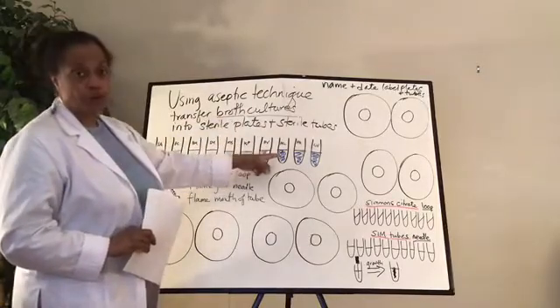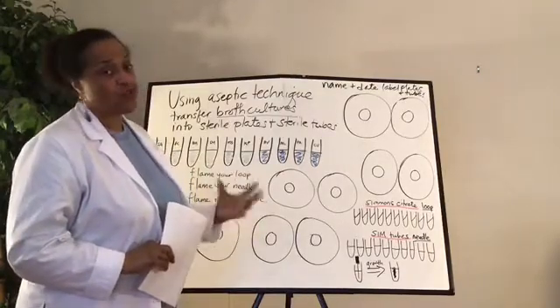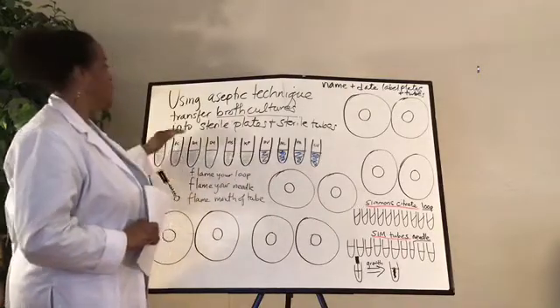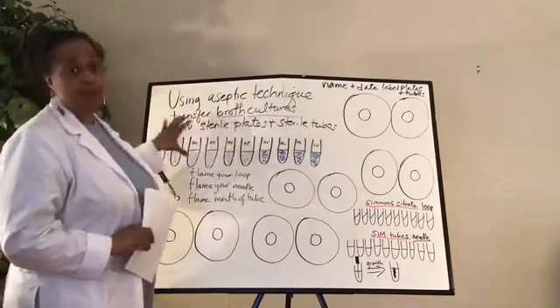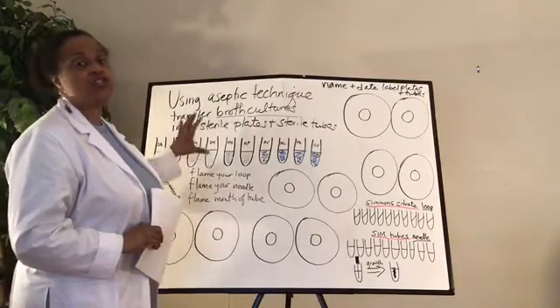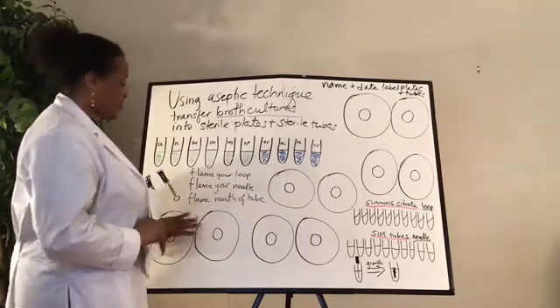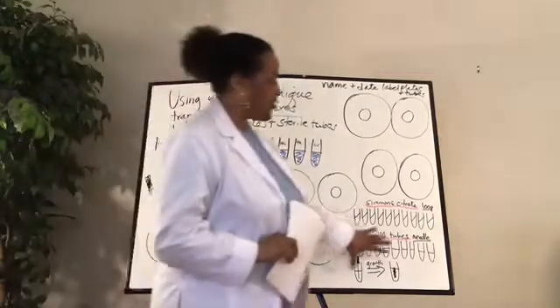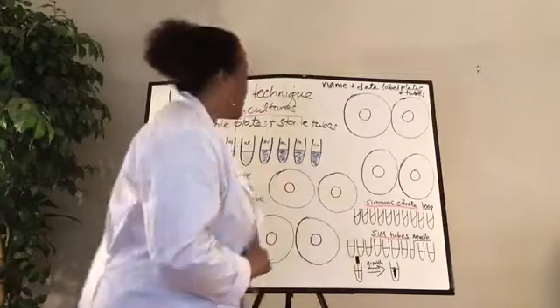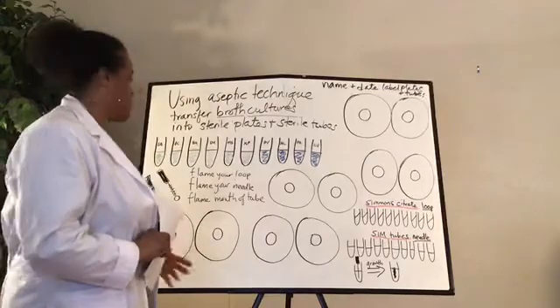You see that they're turbid. Turbidity means what? That there's growth. It's cloudy, there's growth in here, right? All of these 10 bacteria have growth in them. You're going to transfer these 10 bacteria into sterile broth, onto sterile agar. All right, so these drawn up here, these are all sterile. You notice there's no turbidity, they're all clear. So after you inoculate them, we're hoping that you get some growth where it should be.